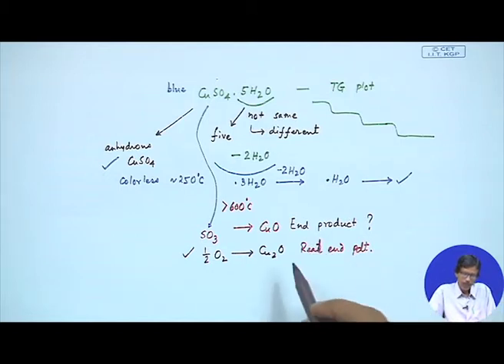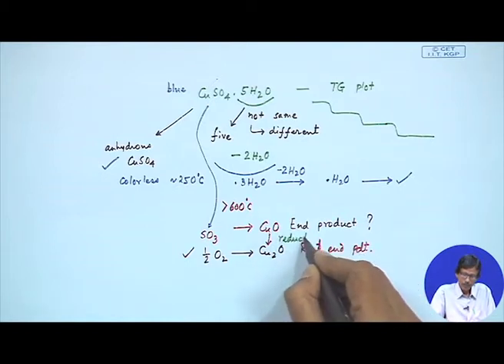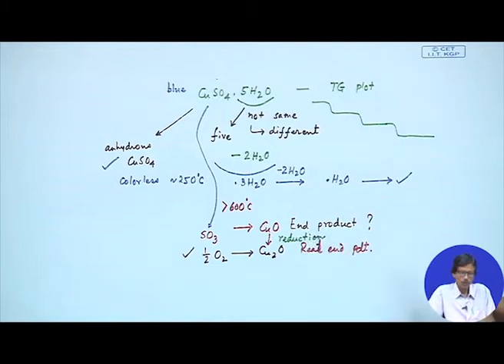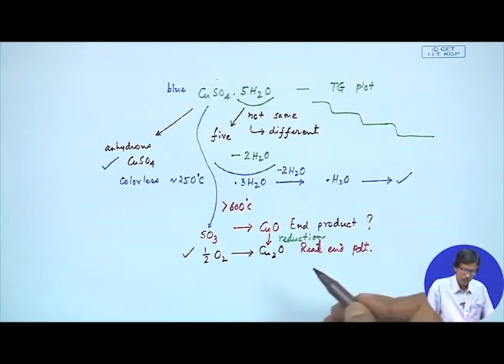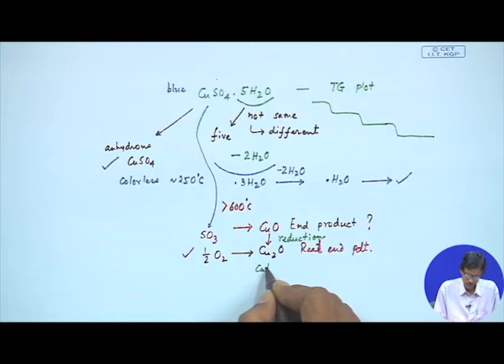So, this conversion from cupric oxide to cuprous oxide is basically a reduction process. So, at high temperature we go for this typical reduction. No reducing agent is required, it is only the elimination of O2 gas. O2 itself is going out from your sample, giving rise to your Cu2O. Because this particular Cu2O is also a very good and useful species, it can be a catalyst also.